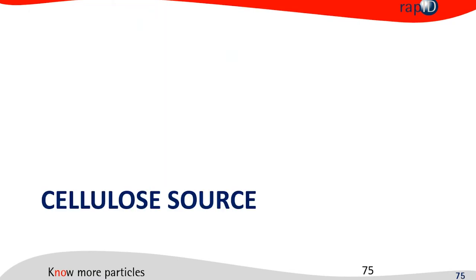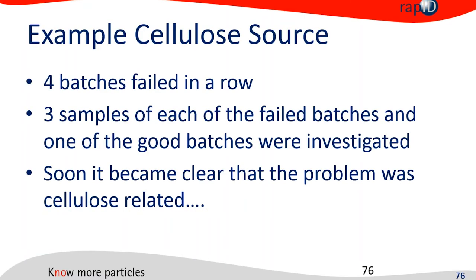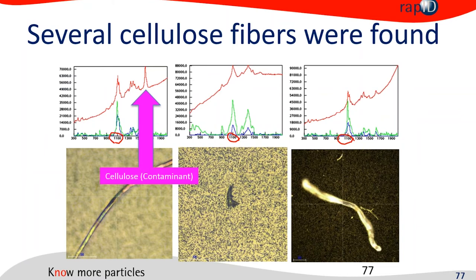Now the cellulose source case — an investigation we conducted a couple of years ago. In this example, four batches failed in a row. We looked at three samples from each batch, establishing what you could now call a short-term particle profile for that product and tried to find the source of the problem. It very quickly became clear that cellulose played a big role, and in this case the cellulose gave us an advantage: the majority of that cellulose had an extra peak, and we knew where to look.